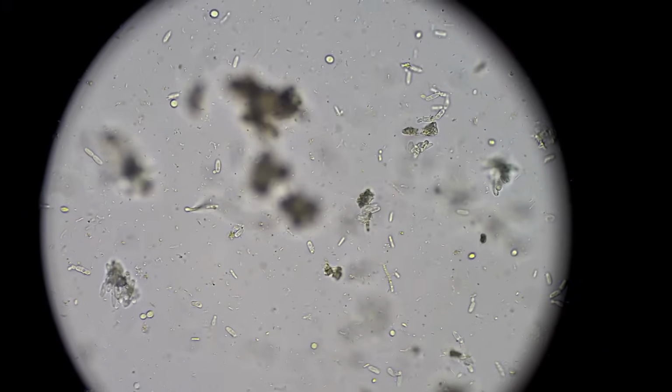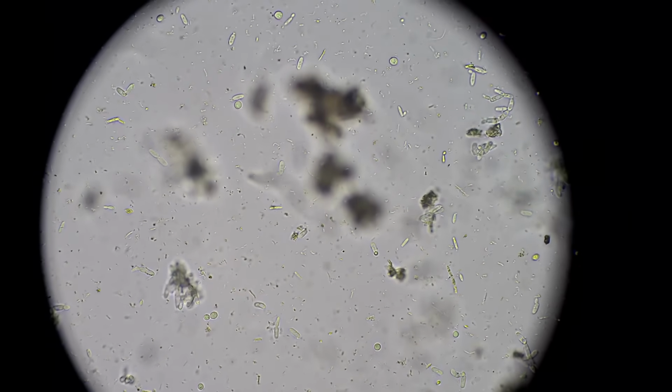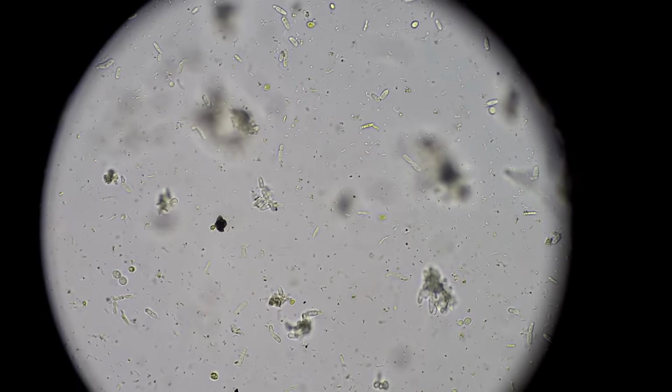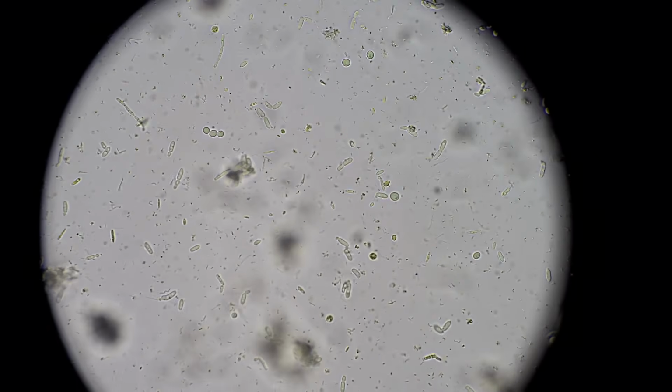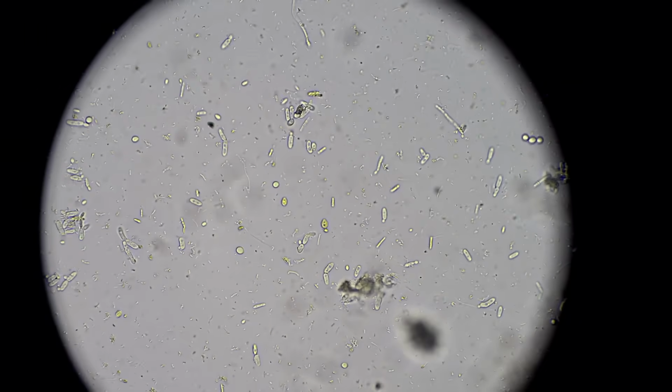And I'm not talking about necessarily the medical grade or the food grade EM. I'm talking just about the regular EM that I've tested. Candida is in there as a known ingredient.